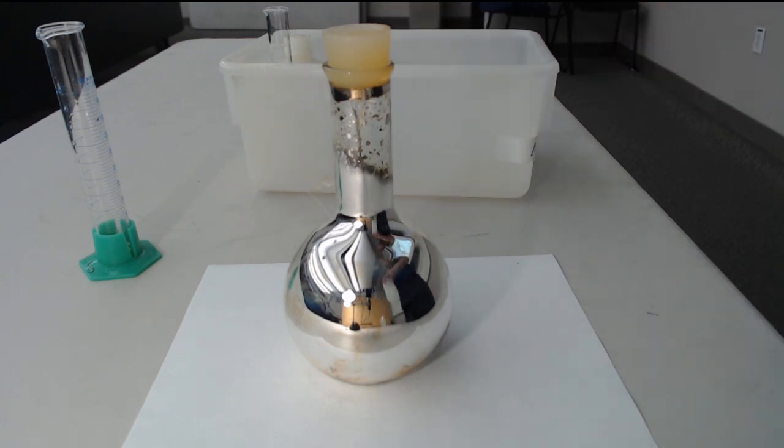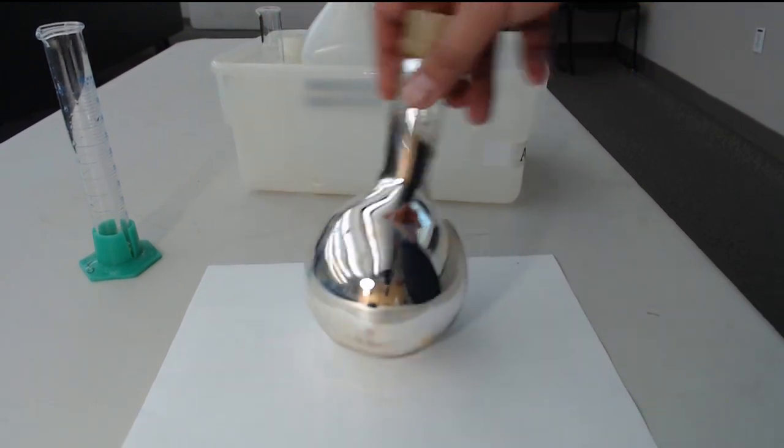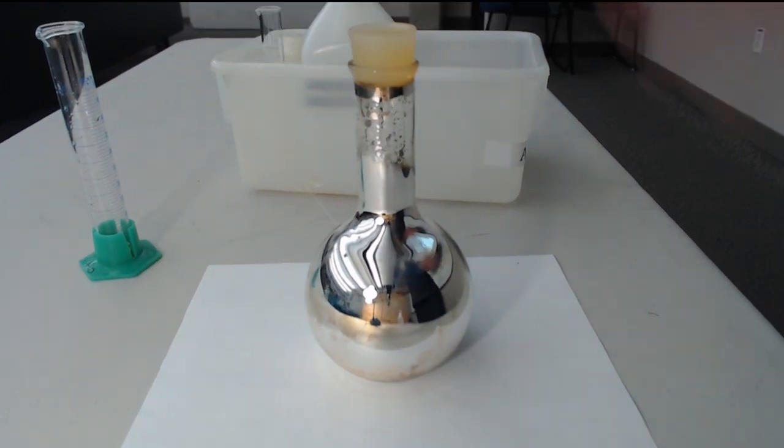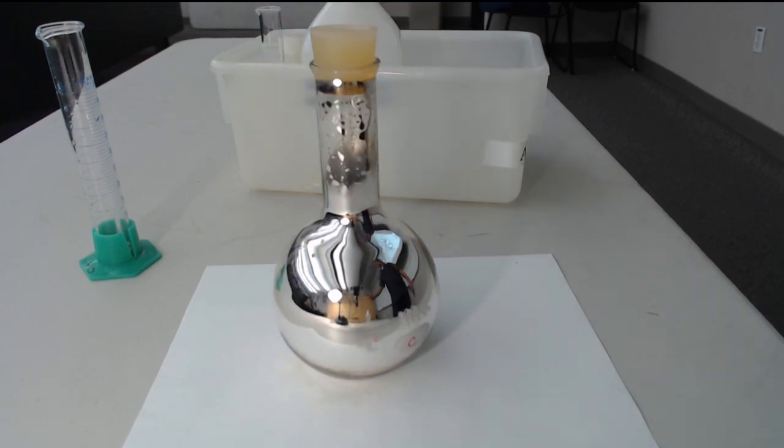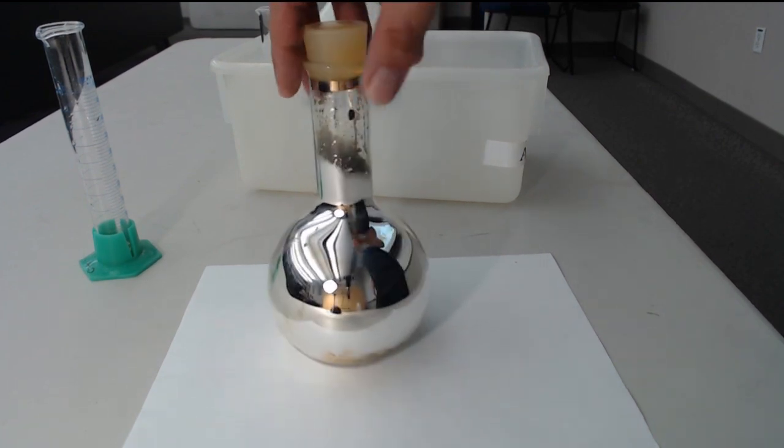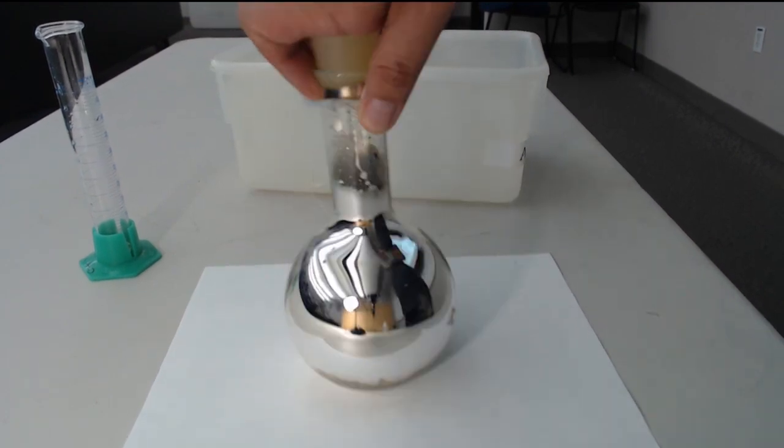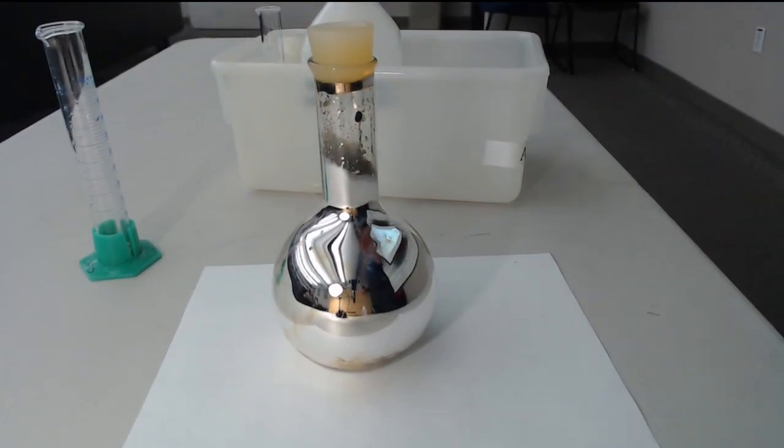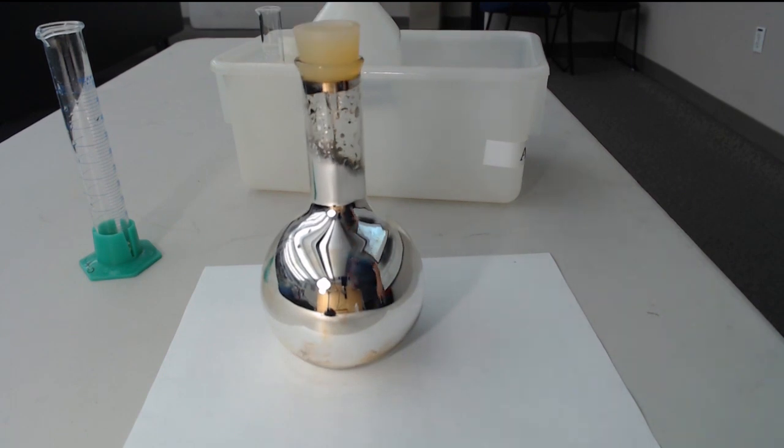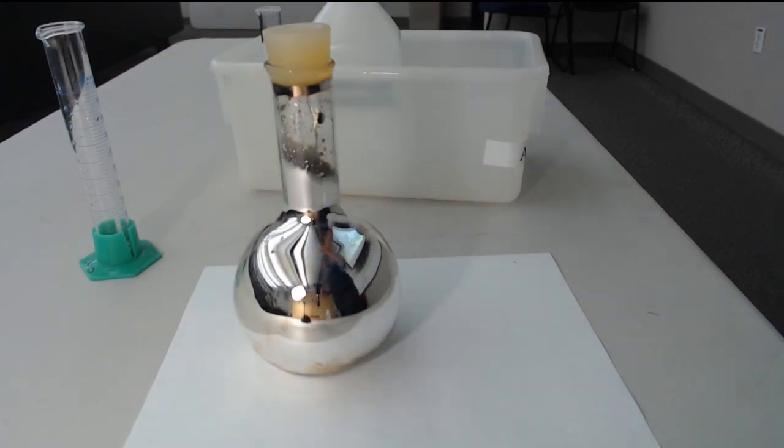I actually can clean this off very easily. All they got to do is add some concentrated nitric acid to it. And nitric acid actually dissolves a lot of metal. And it'll actually give up a brown gas. And that part of the demo I cannot do in the classroom because the gas it gives off is highly toxic to humans. So I will actually clean it in the hood, but I'll probably actually record it to tack onto the end part of this video that I'm recording. But pretty cool, right? I actually have one of these that I made and I actually checked out a little bit more to actually plate the whole top of it. And I basically dumped out the liquid inside and cleaned it out with not nitric acid just to clean out the chemicals in there. And it's been sitting in the display case over by my office right above the planetarium. It's been there for about three or four years now. And it's permanent. It doesn't come off until you actually add the acid to it. It'll stay there forever.